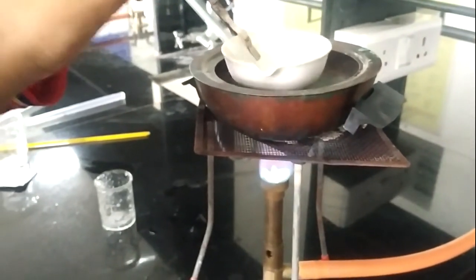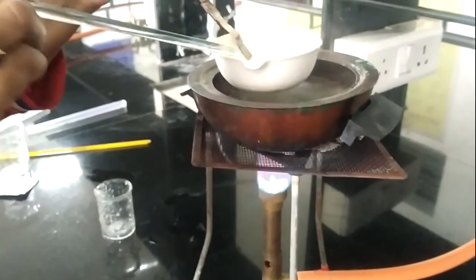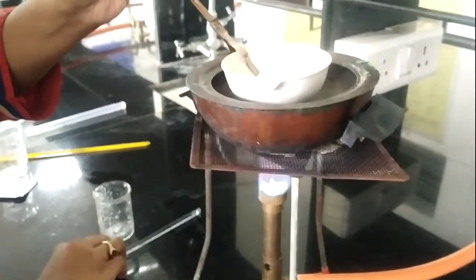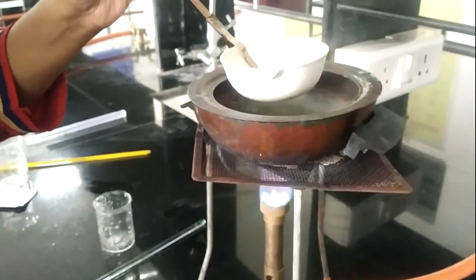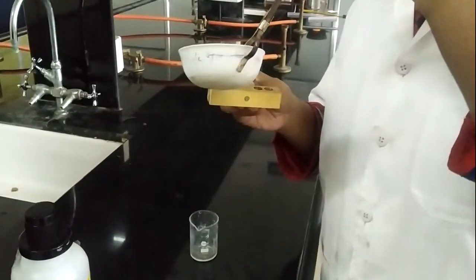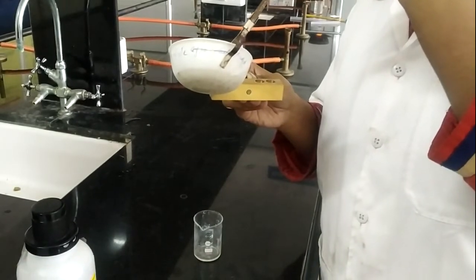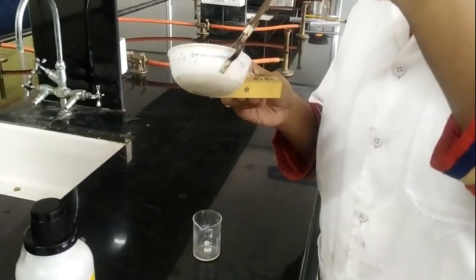Now, as the mixture is properly formed, we will proceed to pour this mixture into the previously lubricated suppository mold for forming the pessaries. I am going to pour this mixture into the lubricated mold.